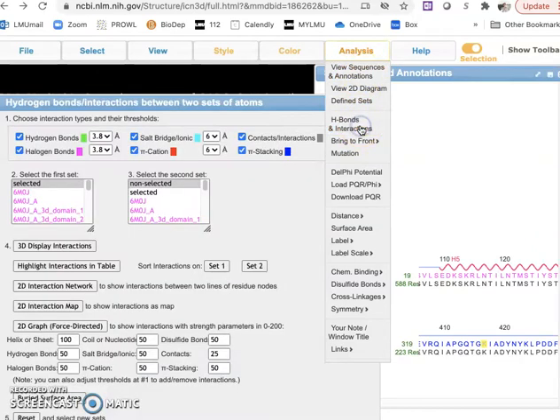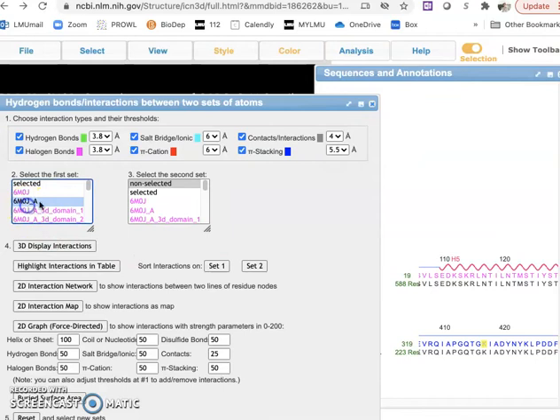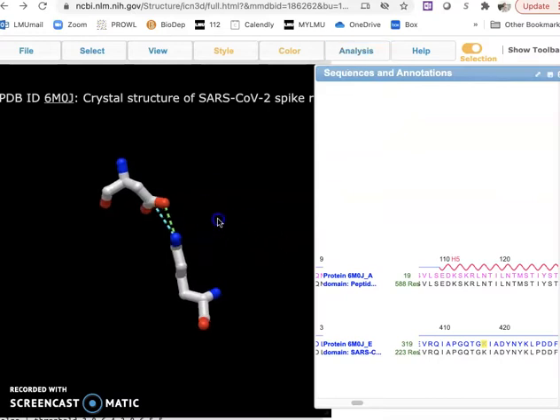I will go to the next step of analysis, H-bonds and interactions. I select the first set as the receptor, the second set as the spike protein again. I want to focus on ionic salt bridges, ionic bonds, and hydrogen bonds, and see the 3D interactions of that.